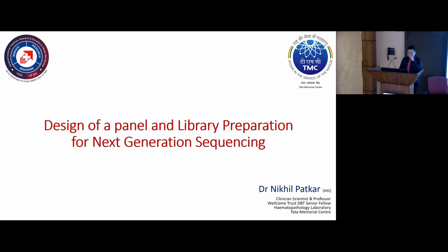Hi everyone. This is a more technical talk on how to design a panel for NGS and library prep. So what most people do when they want to design a panel is call the company and say, "Make us an NGS panel." He'll say, "Solid wala banwa do, heme wala banwa do." That is what most people do. When we were new to this, even we did the same.